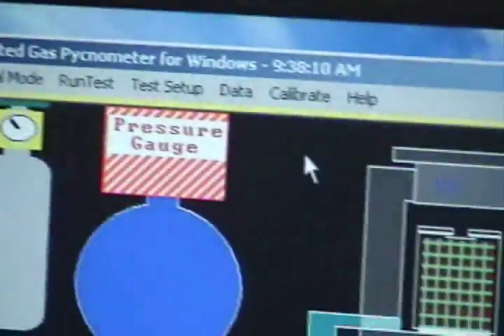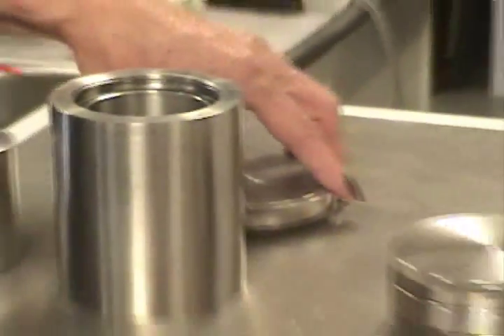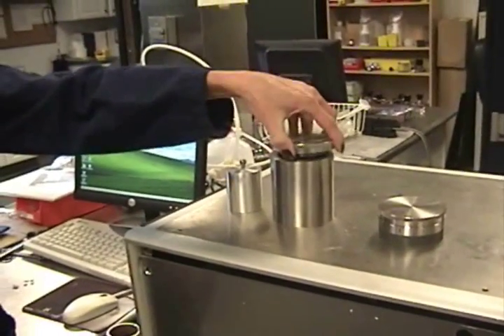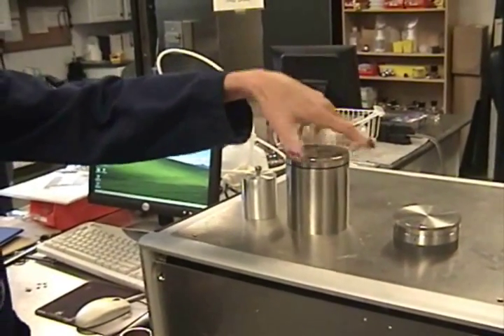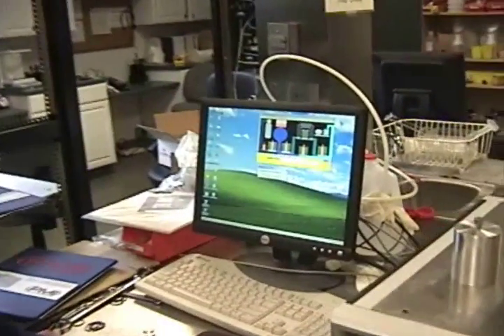Go to Calibrate, then Volumes. It's going to empty and seal the sample chamber. This is your sample chamber — there's nothing in it. Just select OK.